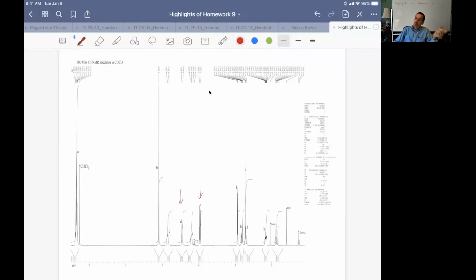We had that bromocamphor sulfonic acid problem in the last homework set. And we already saw how, although I say normally you want to focus on isolated methyl groups, in terms of placing them, isolated by HMBC, isolated methyl groups can also be really, really interesting to look at. So I want to show you something that's really, really cool. Isolated methylene groups can be really interesting to look at.